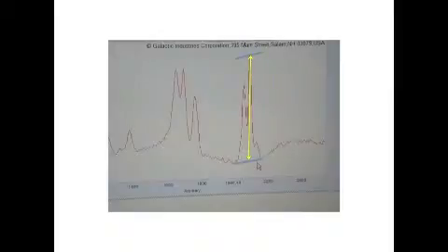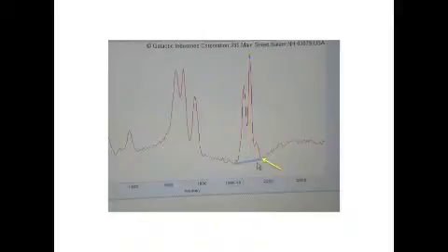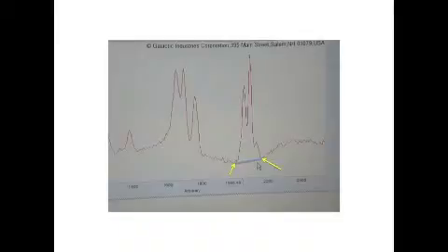We need to subtract out the value for the baseline directly below the peak. If the peak is directly above the center of this baseline, then we can take an average between the value at the point on the right and the baseline on the left. We subtract the average value between these two yellow arrows from the total peak intensity.